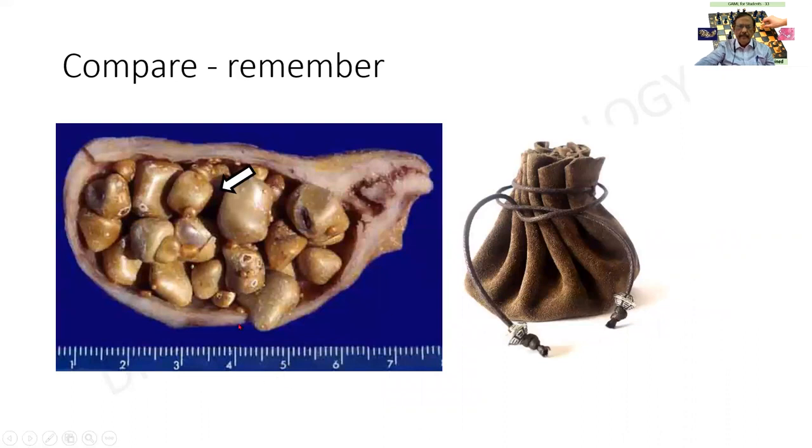A third specimen. This I have pertinently given for you to compare. This is a cholecystectomy specimen, or a specimen of the gallbladder, measuring so many centimeters long. The wall is about 2 to 3 millimeters and it has got multiple calculi, some of which are very small, hardly 2 to 3 millimeters, whereas some are more than 1.5 centimeters in diameter. The color is brown and it has got a faceted edge.